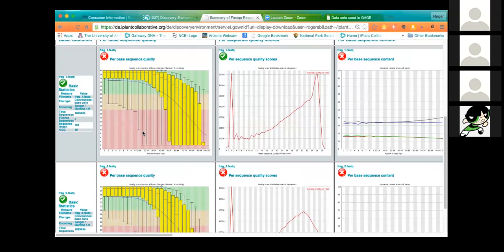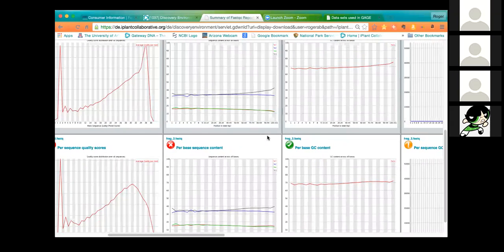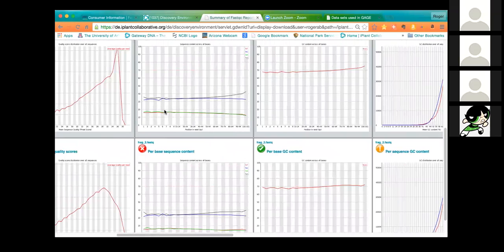But in any case, for this end, which is often the most important end to consider as far as trimming goes, if you want to save a lot of reads, then maybe you want to cut it off around 15. If you feel you have plenty of reads, then you may want to cut it off at 20. But this is where your judgment comes in. You have to decide for your project. And there may not be any one perfect answer, and you don't necessarily have to stick with your answer. If you find after running the HTProcess Trimmomatic step that follows, maybe you'll decide, well, I didn't like the results there, so go back and do it again, starting with the results from this app.